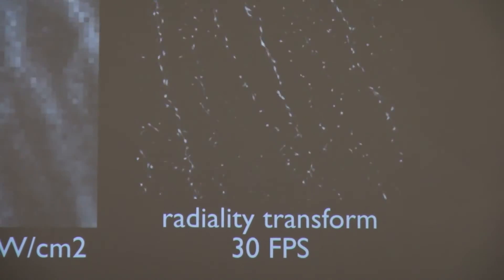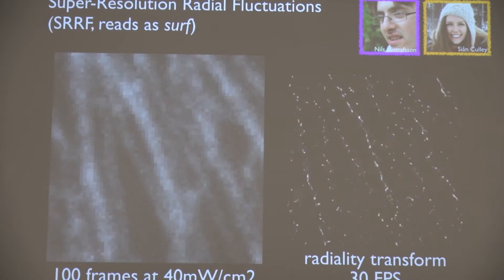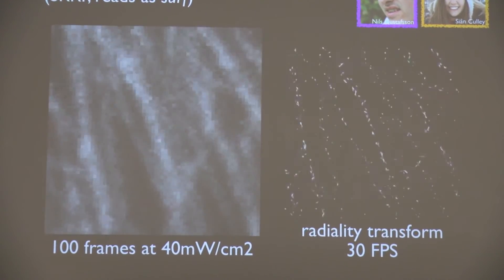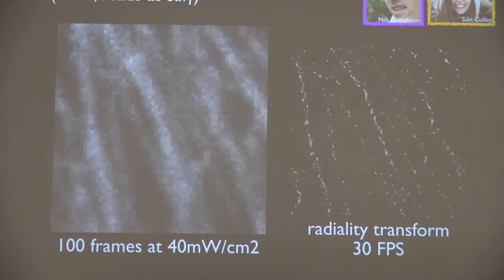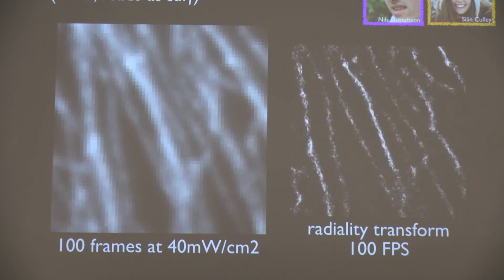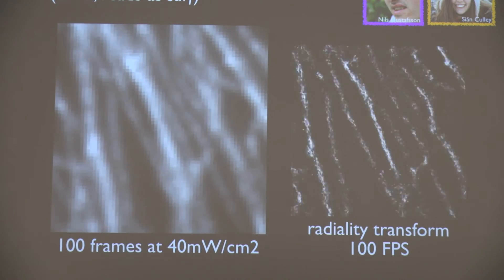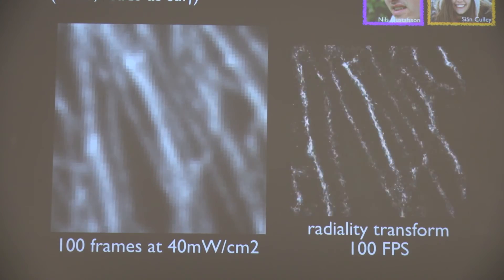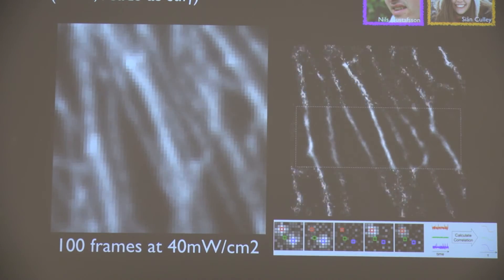So how does this look? Once we start applying that special transform, we end up with something like this. You start seeing peaks being extracted from these fluorophores. The cool part is that visually by inspection you can't even see particles blinking there, but the algorithm is already starting to pull those apart. Speeding this up to 100 frames per second, you immediately start getting structure and super-resolution. What I'm showing here is just increasing the speed at which I'm applying the transform over 100 frames per second. Now, if I start using temporal correlations on this data — borrowing some ideas from SOFI — I start clearing this out and end up with a pretty decent reconstruction of what those filaments are in space.